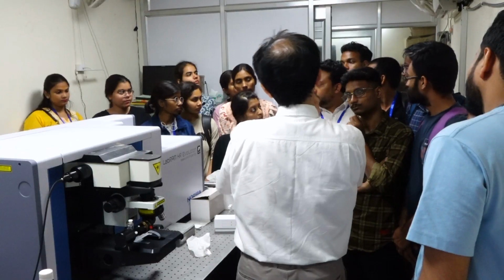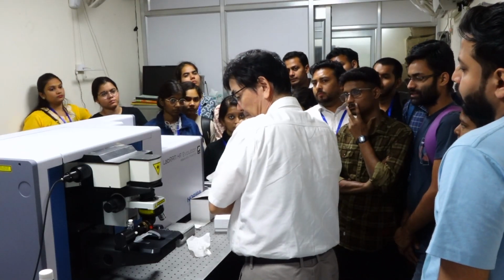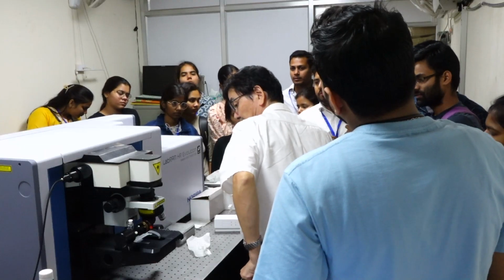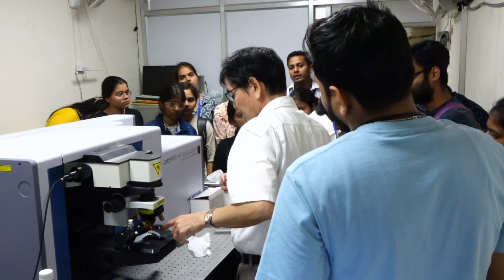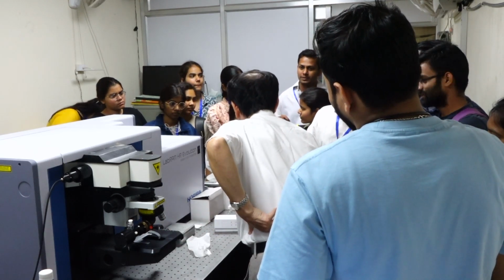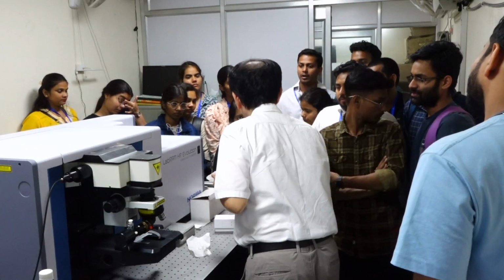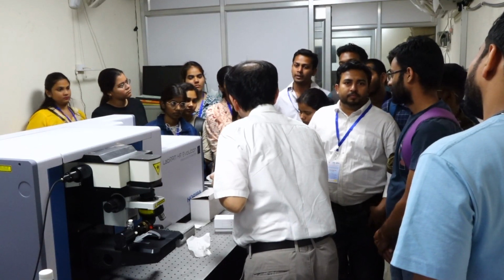How are scattered rays collected from the sample when we start the experiment for collecting our spectra? It's based on scattering of light, so how can we analyze how much radiation is scattered from the sample?